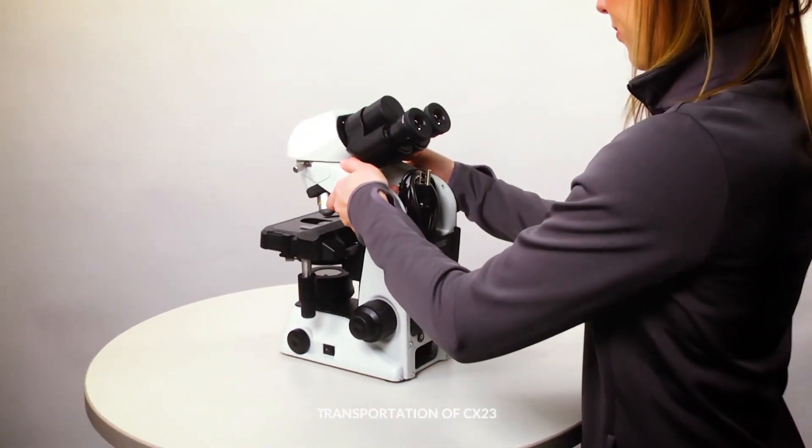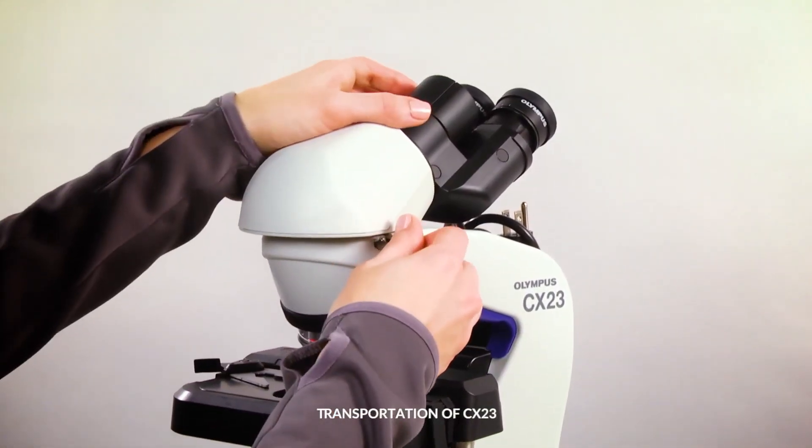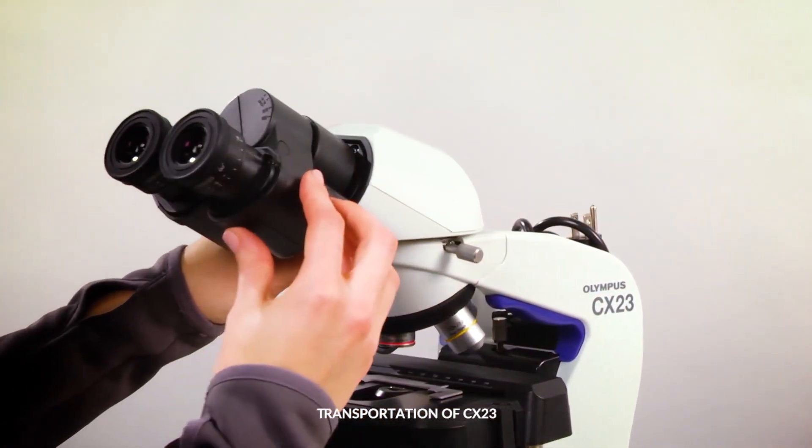Gently place the CX-23 microscope on a clean bench space. Rotate the observation tube by loosening the clamping knob, turning the observation tube, and then tightening the clamp.